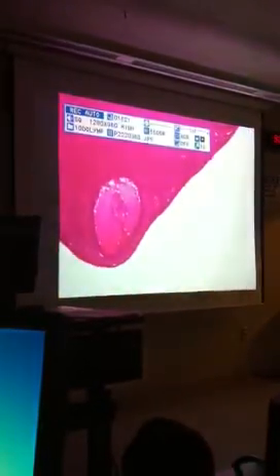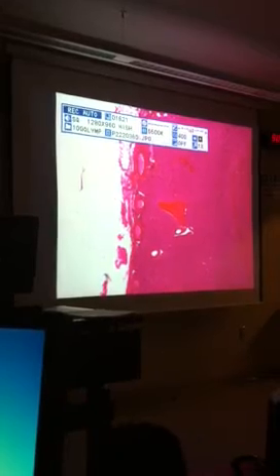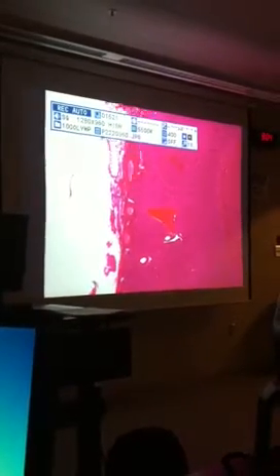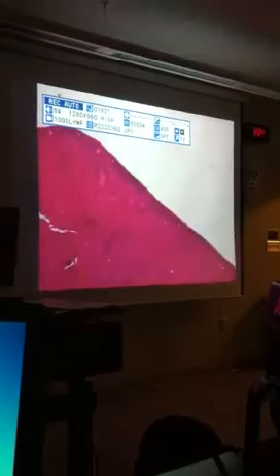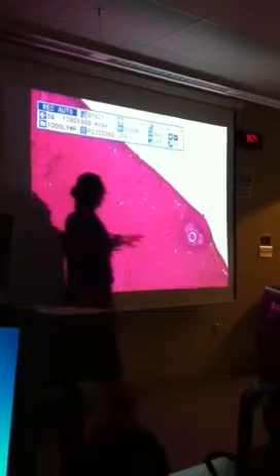And I'm not going to ask you to know, is that a primordial follicle, a primary follicle, a primary oocyte, a secondary oocyte, but you should be able to see, again, on the edge is where you're going to see these follicles, and then the oocytes will be in the middle of them. So again, just always look out on the edge. This is the best one on this one right here.